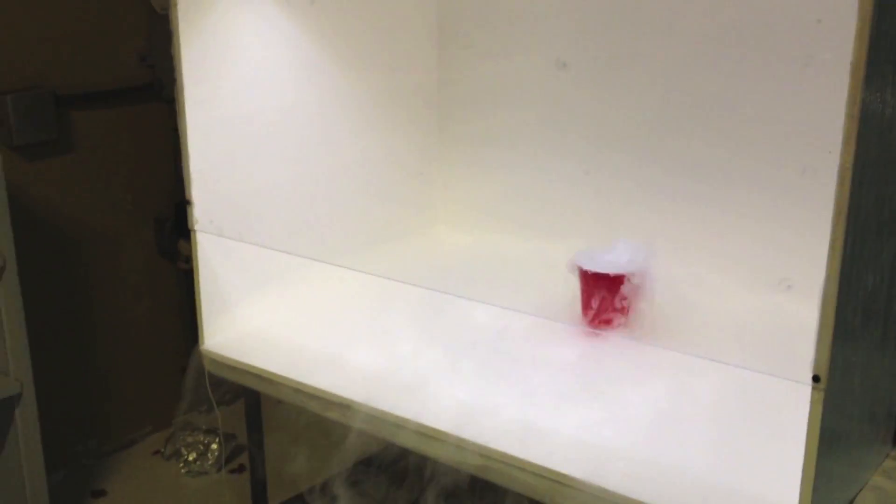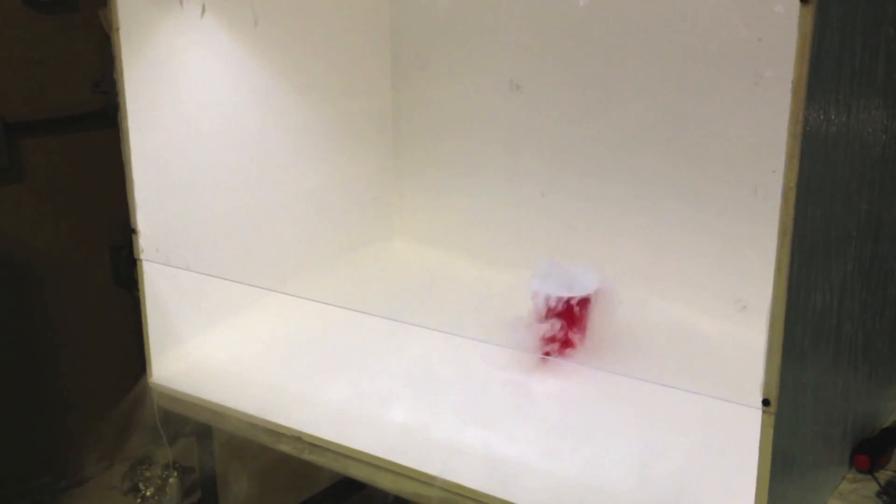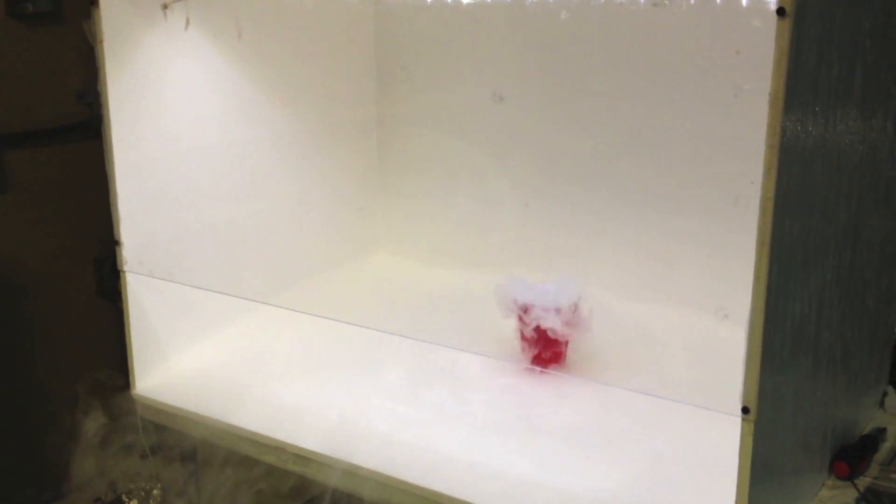We can see that without the fan on, the fog is coming down over the side of the hood and past the front, coming out. Now we're going to go ahead and turn the fan on and see how quickly the fumes are taken care of.